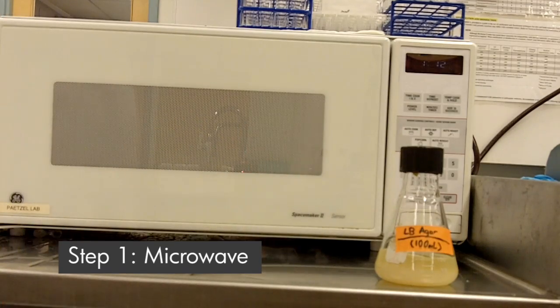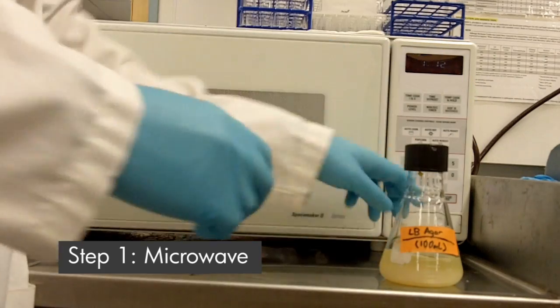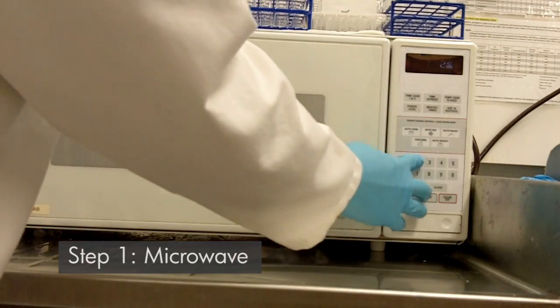Now we're going to melt the agar using a microwave. First of all, you have to loosen the cap, and we'll put it in there and set the time.